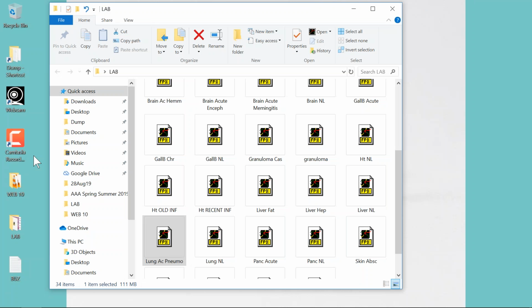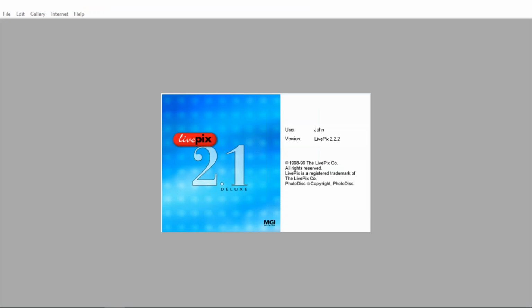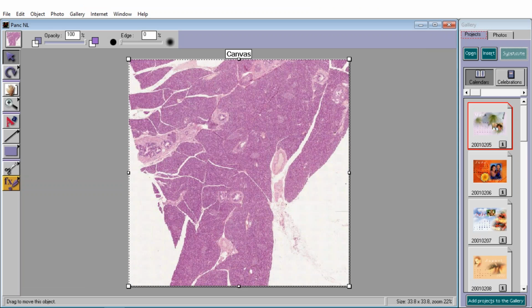Okay. Oh, we want to move on a little bit. Here is the world's most normal pancreas. And I think you'll at least agree that it's an exocrine gland. It has ducts between the lobules. It has ducts within the lobules.